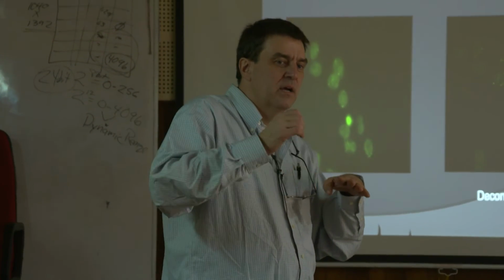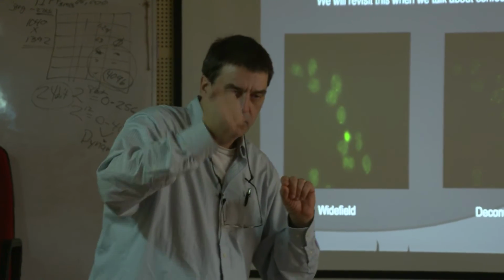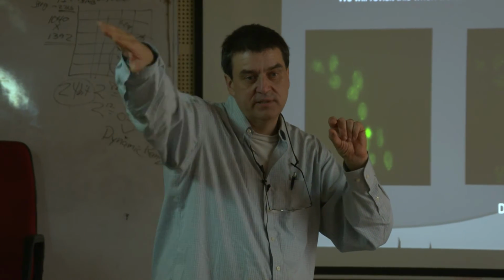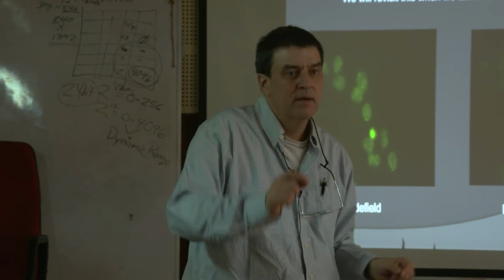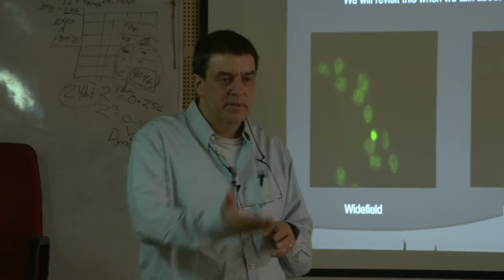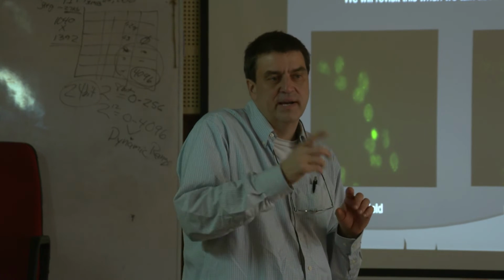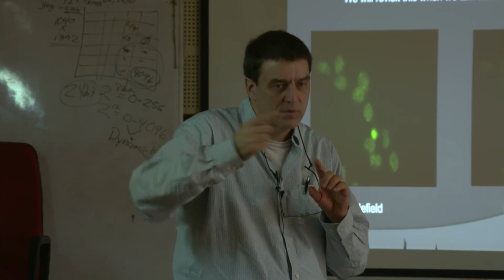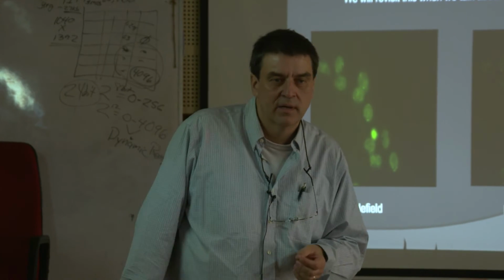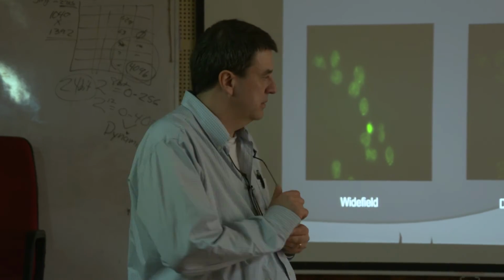Same thing in biology. If you're working with a sample, you're usually best off to take aliquots. Say you get 100 microliters. Make aliquots of 10 microliters. Freeze the other nine. Use that one until it's done. Then break out another one. That way you'll save your reagents. There's no sense having the whole tube sitting around if you're not going to use it. Freeze little bits aside, but don't go back and forth. When you start going back and forth, chances are it's just not going to work anymore, because freeze thaw is really hard on biological material. Okay.